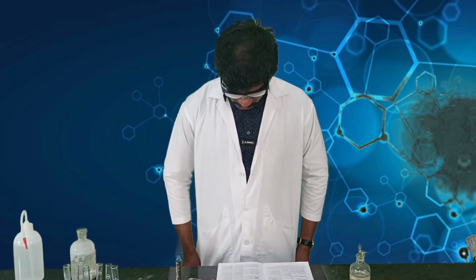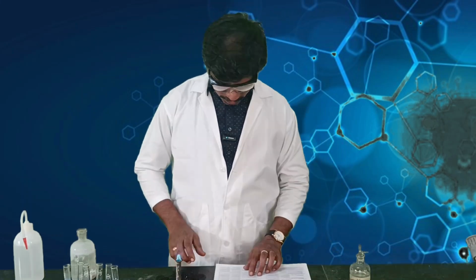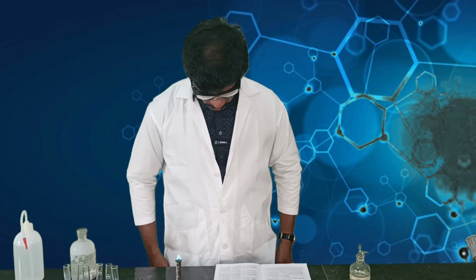And then next we shall see the test for carbohydrate. Carbohydrate can be tested using sulfuric acid.